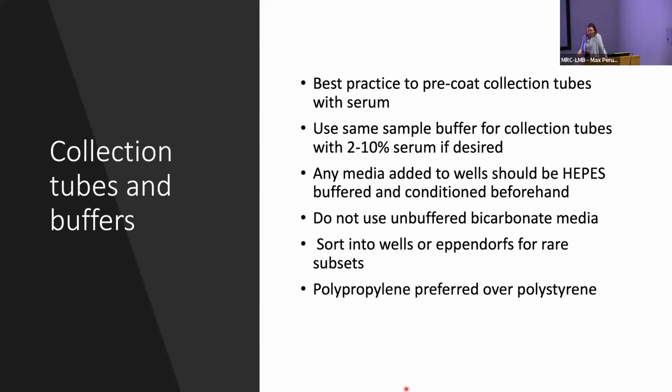And we do recommend polypropylene tubes over the polystyrene FACS tubes. It's mostly because the cells adhere less to the tube wall in the polypropylene tube. Basically, polystyrene tubes can add to a buildup of charge in the deflected drops on the surface.